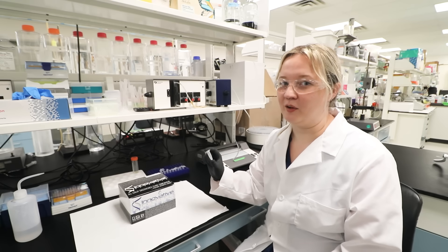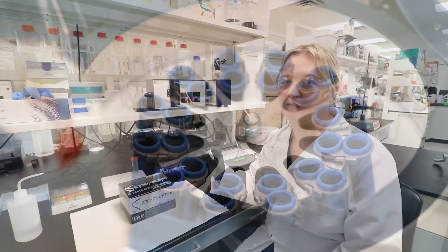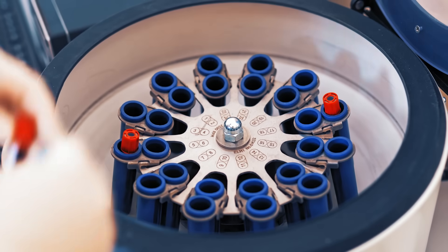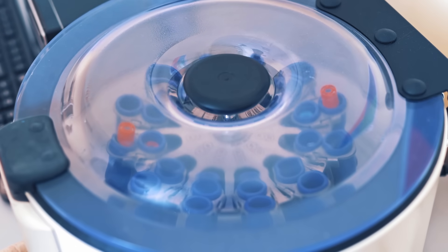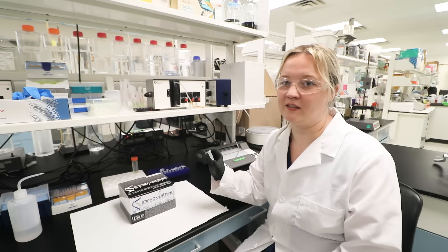I have my plasma sample here, but if you didn't, you would want to collect plasma using EDTA or citrate as the anticoagulant. Then centrifuge the sample for 15 minutes at 1000 xg within 30 minutes of collection. Once complete, either immediately start the assay at room temperature or store the sample at negative 20 degrees Celsius, avoiding repeated freeze-thaw cycles.